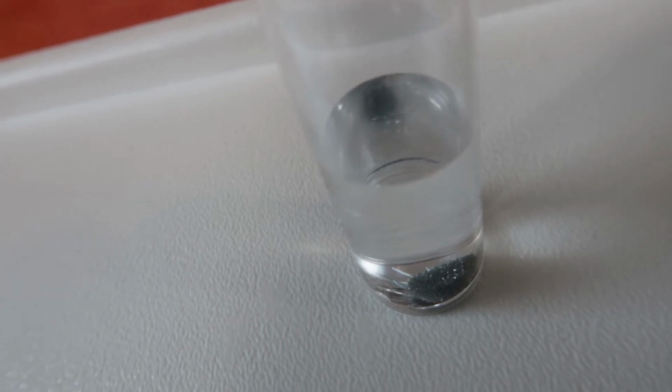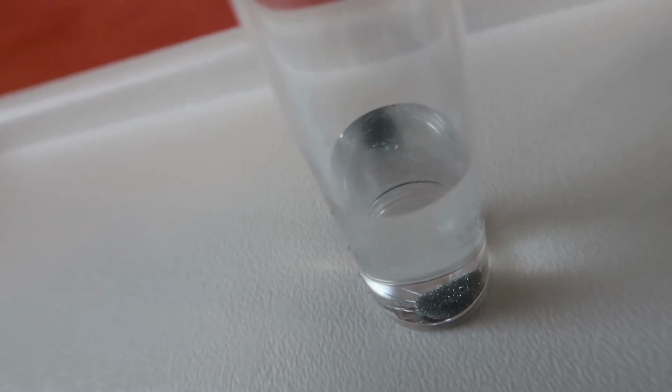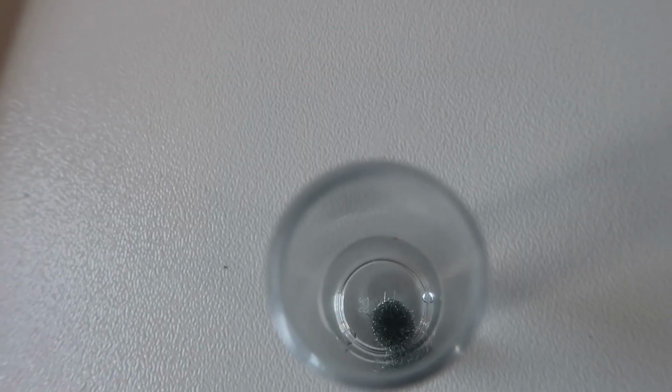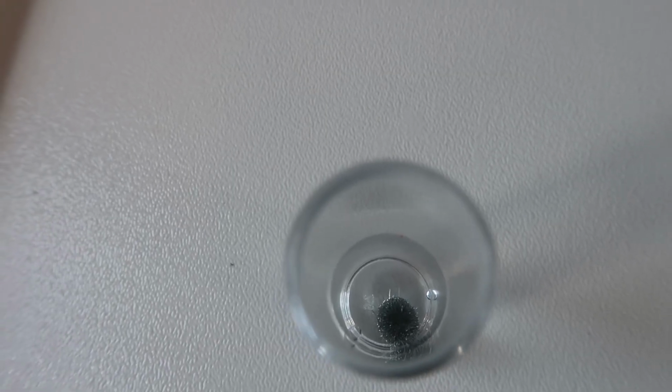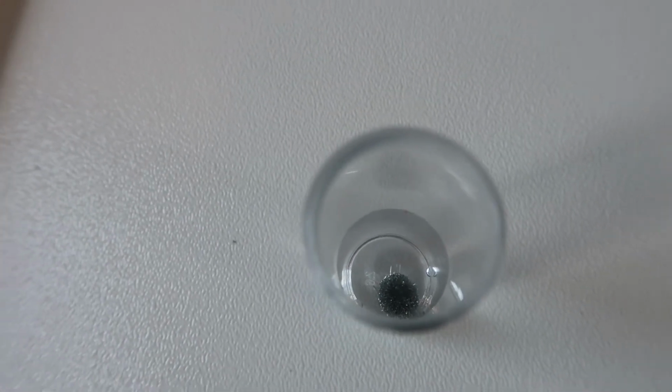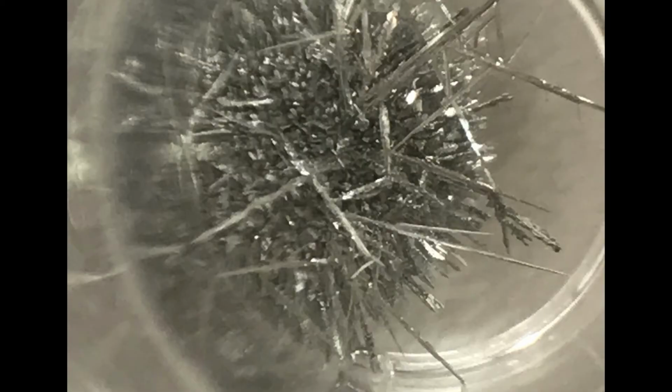Oh, cool. So it is getting the slight crystals growing on there, isn't it? Can you see them growing? Yeah. Can you see that, boys and girls? I can see them growing actually. Yeah, it's really cool, isn't it? So what did it say, like 20 minutes? So about 20 minutes to do the full thing. So if we just leave it for now, and we'll come back in a bit and show the boys and girls after 20 minutes what it looks like, yeah? Okie dokie. Okay.